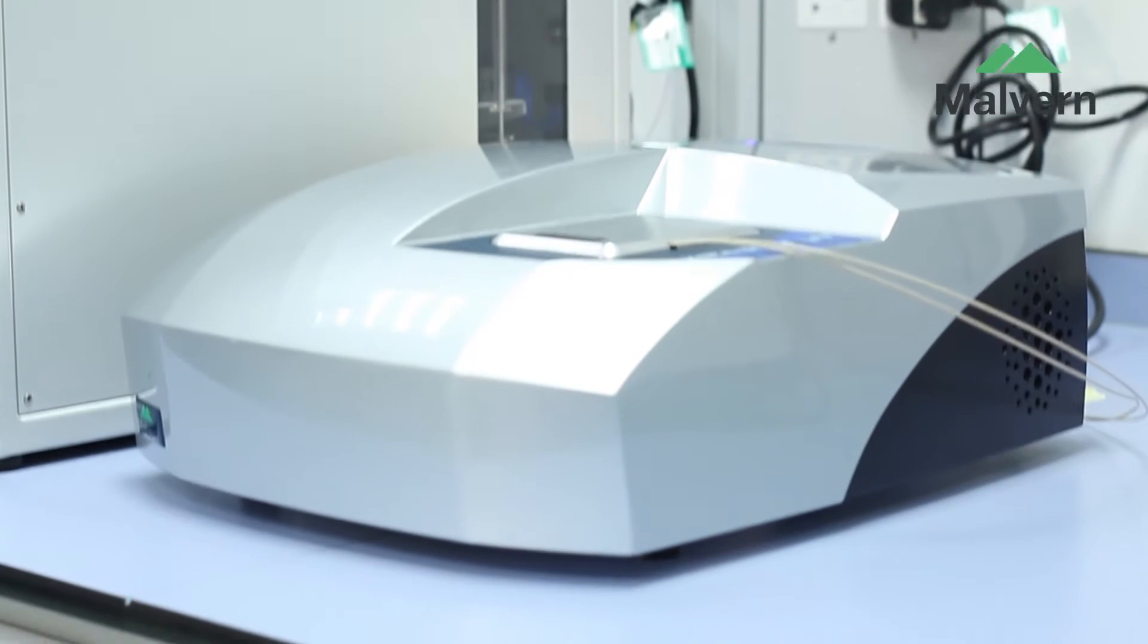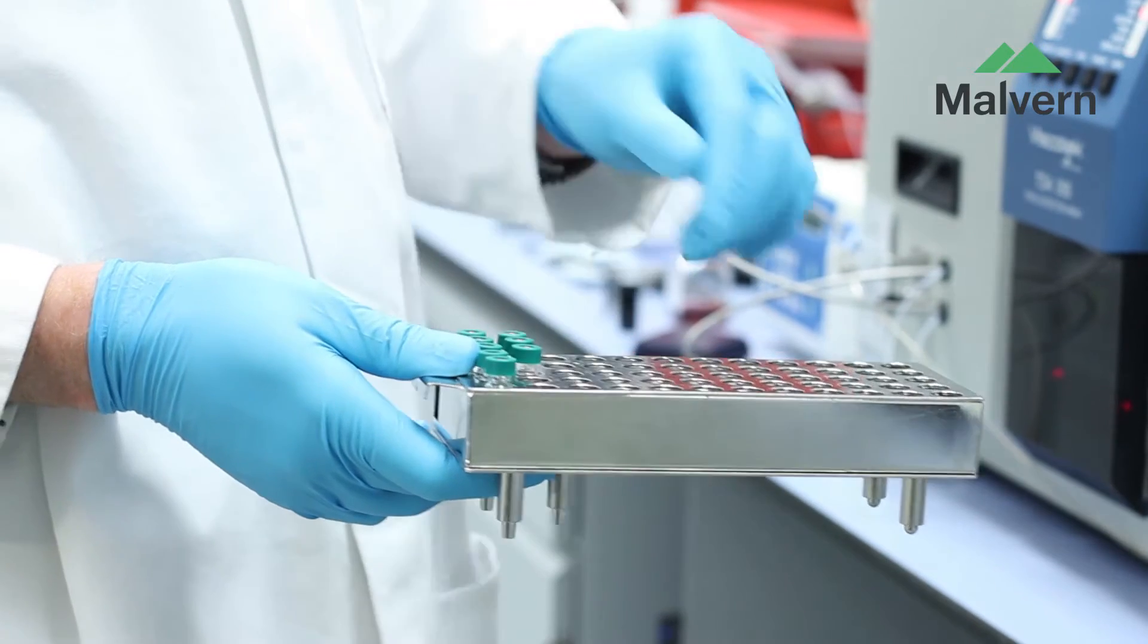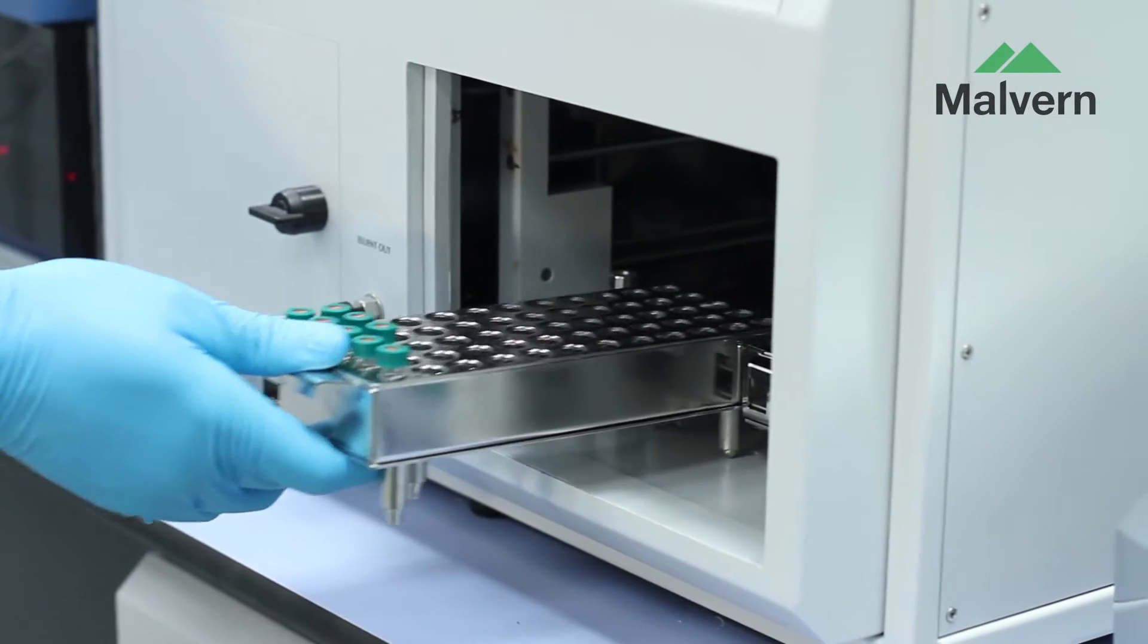Secondly, by simply changing the cell, it becomes an absolute molecular weight and size detector that can be added to any size exclusion chromatography system.